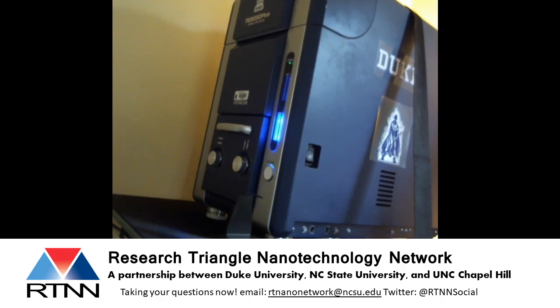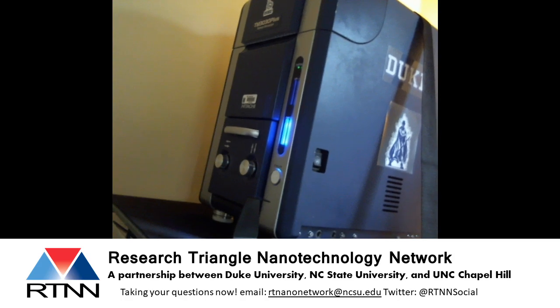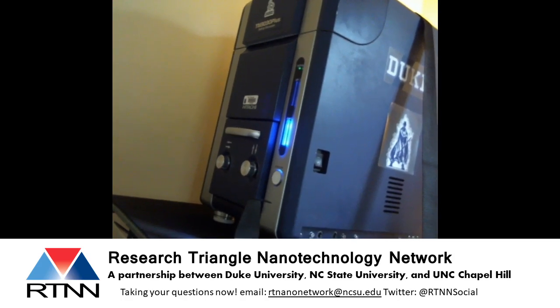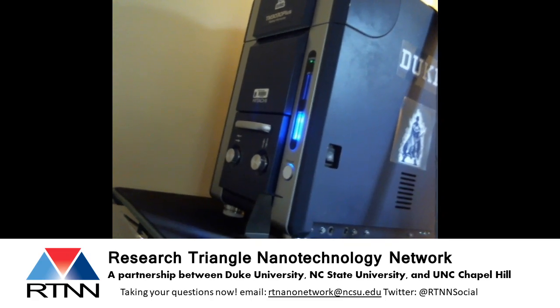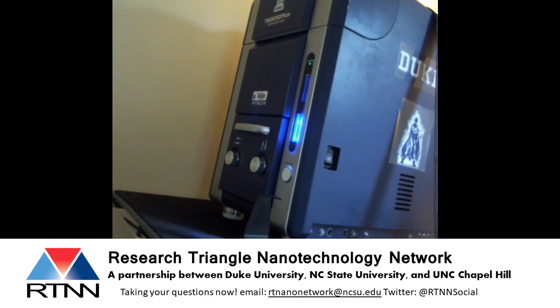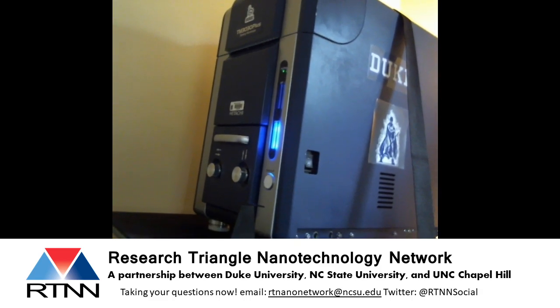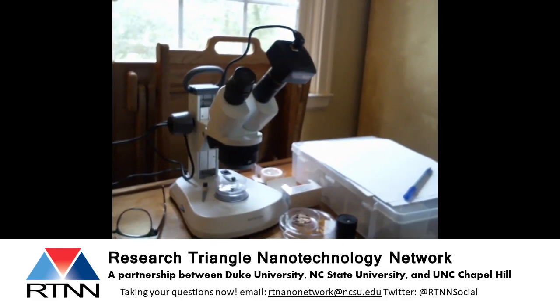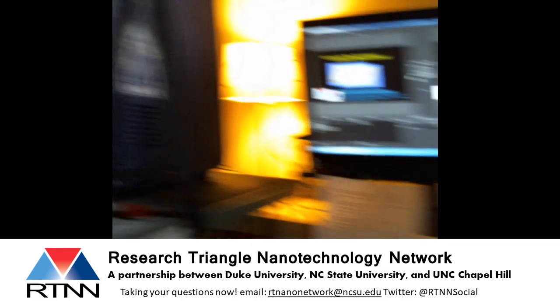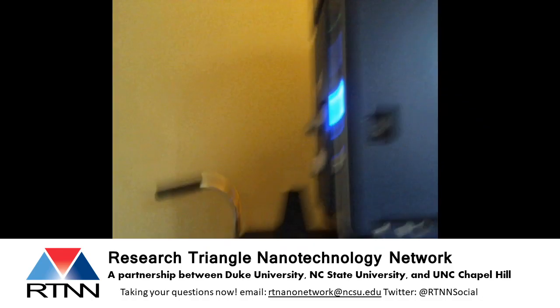I told you that the light microscope uses glass lenses to magnify our picture. An electron microscope uses electromagnetic lenses to magnify our picture. So we've got kind of the same things, but slightly different in each of the two microscopes. And the light microscope is going to let us look a little bit at things. And the electron microscope is going to let us zoom way into things.